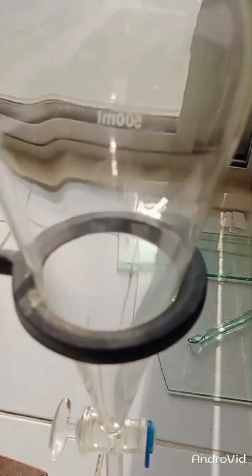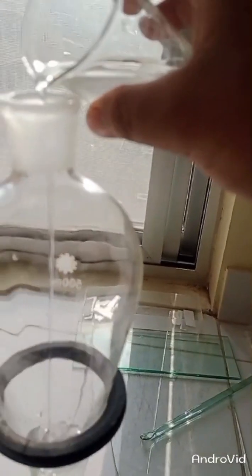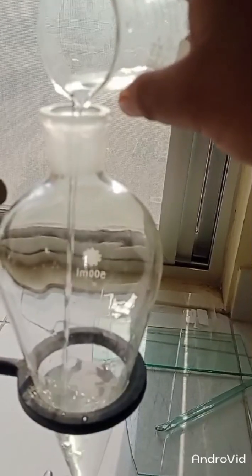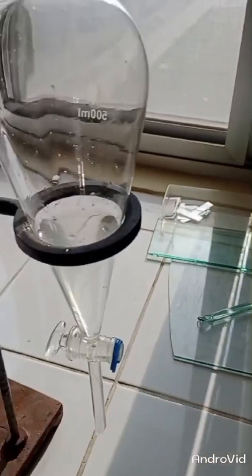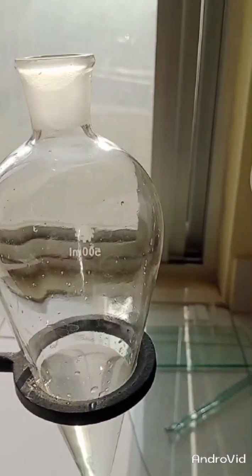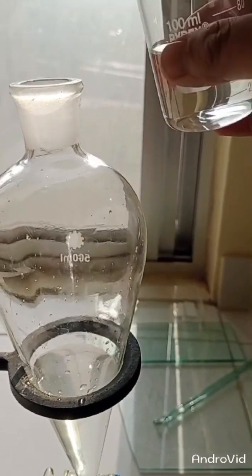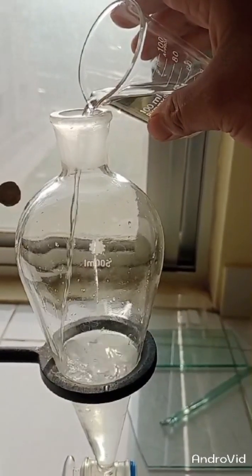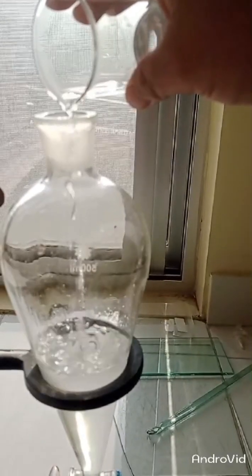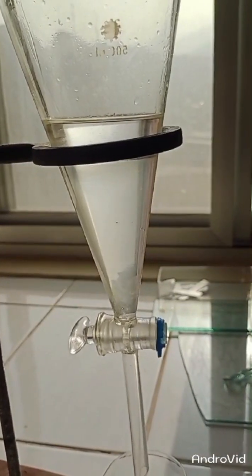First of all, I am going to add water into this separating funnel, which will make our aqueous layer. Now I am going to add my organic solvent, which is ethyl acetate. We are going to separate our ester, so ethyl acetate will serve as our organic solvent and will make our organic layer.